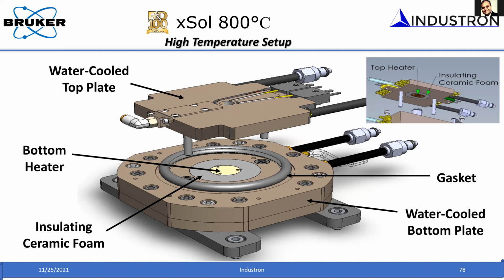Typically metals, when you try to heat, per degree centigrade increase in temperature will give you about microns of displacement. So in such a situation, where per 1 degree Celsius change in temperature will give you a micron displacement, it's a challenging situation. You wanted to measure the property at nanoscale. Okay, so thermal drift is a huge problem when you try to measure property of a material as a function of temperature. How do we solve that?